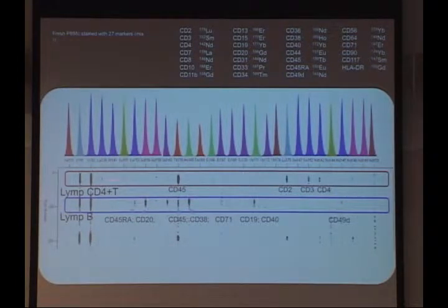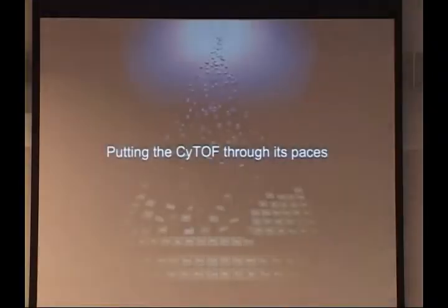This is only a very, very small percentage of what's actually being acquired, but it's kind of a visual readback for you. And the idea here is to show you that individual cell events are being acquired, and that there has to be a little tiny bit of space in between each cell event, because if you can't see space in between each cell, neither can the software or the machine.